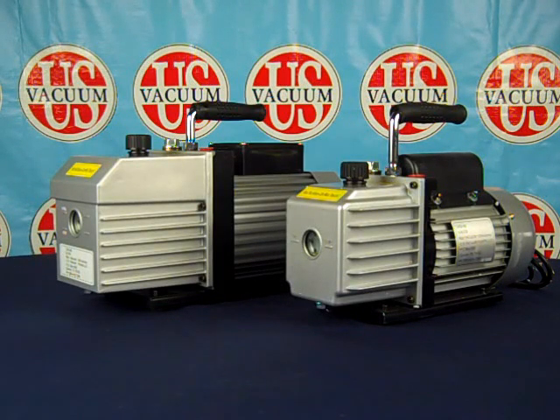This is the introduction to the U.S. vacuum pump models CPS-5B and CPS-8B rotary vane vacuum pumps. These pumps are direct drive, oil lubricated, air-cooled units rated at 4.5 and 8 CFM displacement respectively, with an ultimate vacuum rating of 29.9 inches of mercury — in essence, full vacuum.